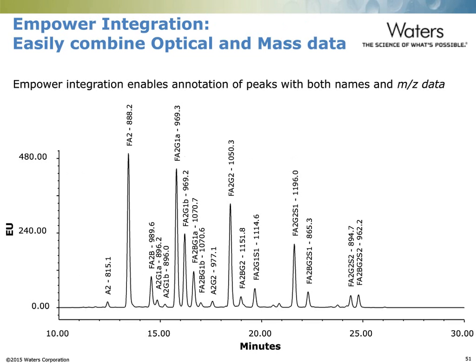As I mentioned earlier in the presentation, the QDa integrates very well within Empower, and what that allows us to do is enable the technology to be used in a more routine analysis. So in this case, we have an example of a set of glycans. These actually represent glycans related to IgG. This is actually a separation of a standard that we sell, the RapiFluor-MS labeled glycan standard.